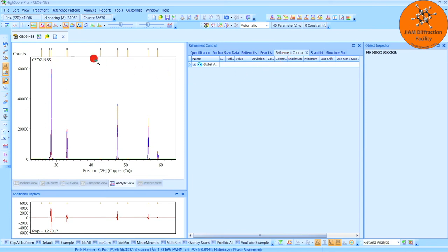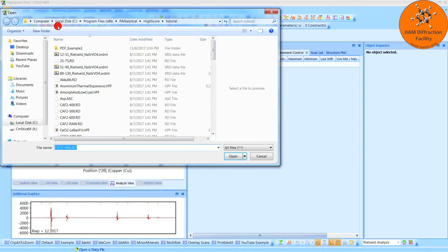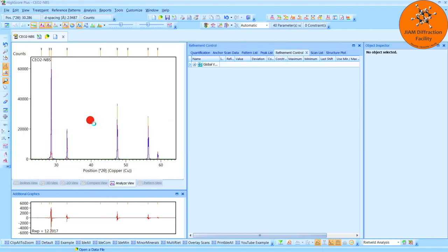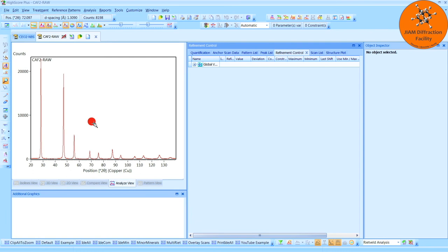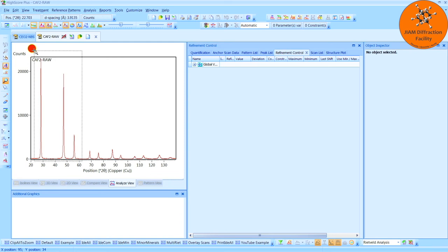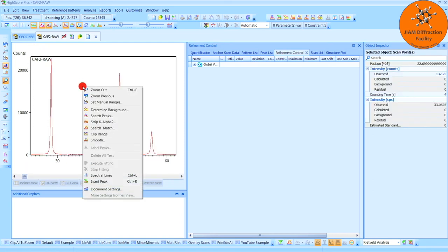Now let's go to File, Open, and let's select the data file that we want to analyze. So like I said, I will analyze the raw, so double click. I am going to focus in on this region here, again about 25 to 65 degrees 2 theta. Right click, Clip Range.